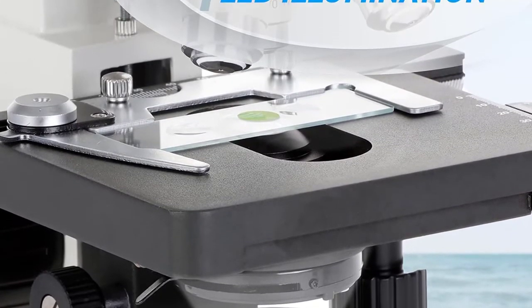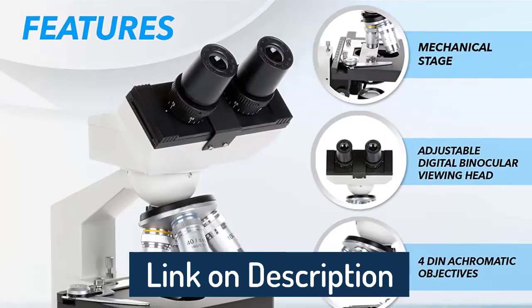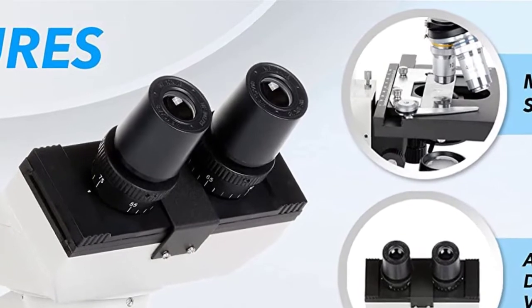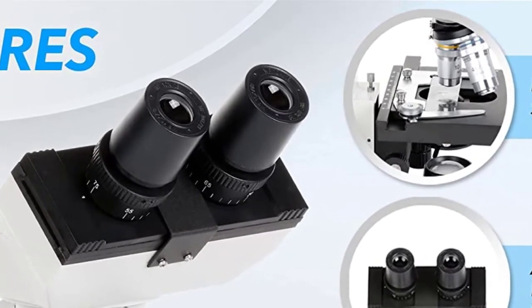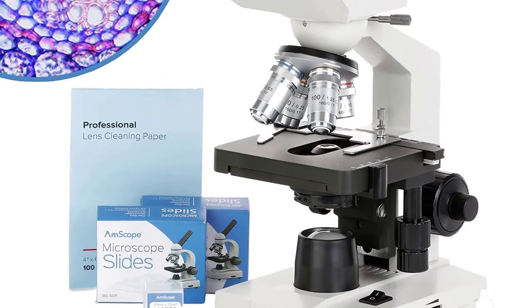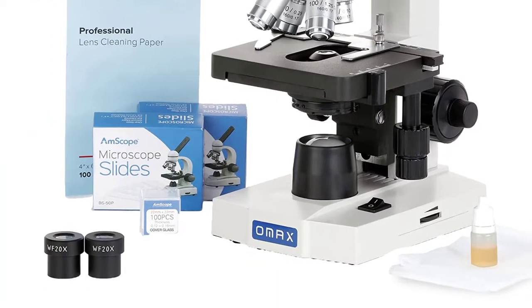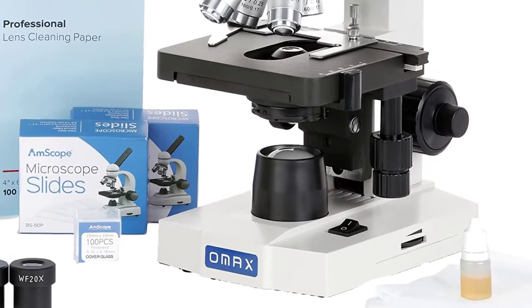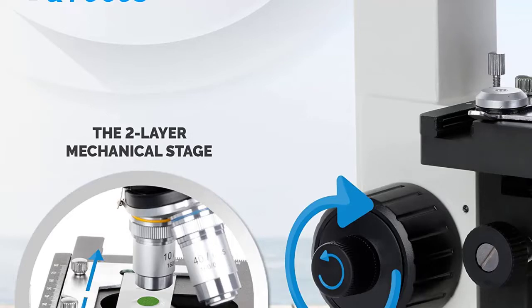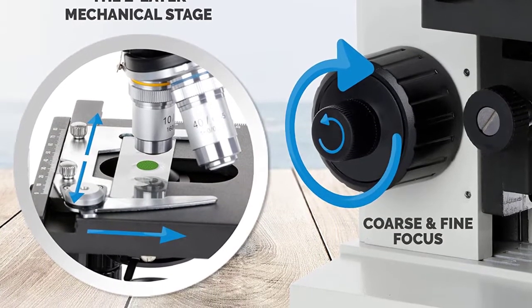Eyepieces: wide field WF10x and WF20x. Objectives: achromatic 4x, 10x, 40x, and 100x oil. Viewing head: 45 degrees incline, 360 degrees swiveling binocular. Sliding adjustable interpupillary distance 55 to 75 millimeters. Ocular diopter adjustable on both eye tubes. Nosepiece: revolving quadruple.